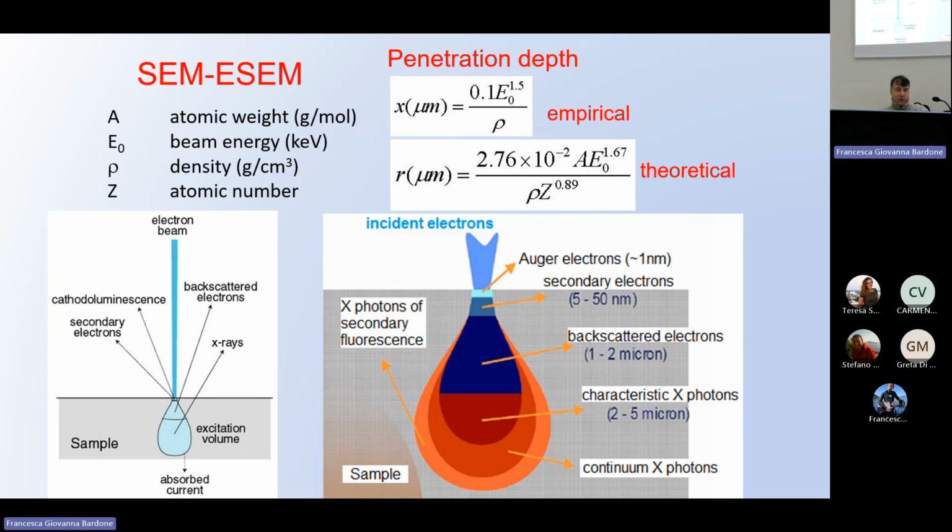And with bulk samples, the region from which the secondary electrons come is very narrow, close to the surface. But the region from which come the characteristic X-rays for the chemistry information comes from the bulk, from microns inside the specimen. Even if you are looking at a very, very small 1 nanometer detail in the surface, the information comes from this area. Always keep this in mind.